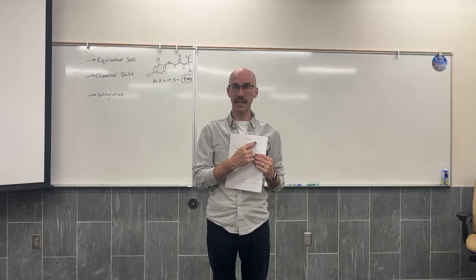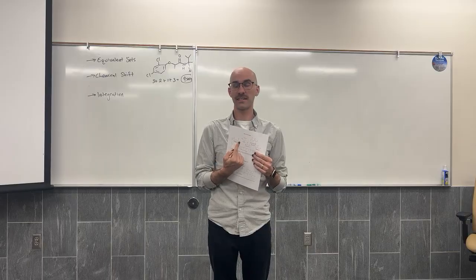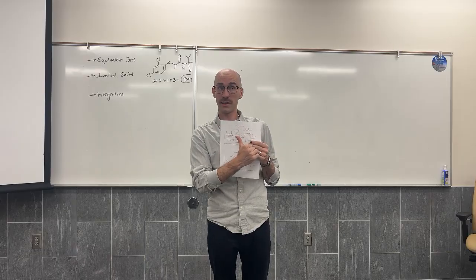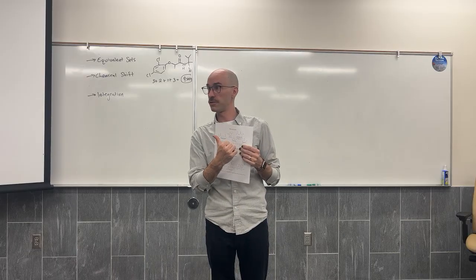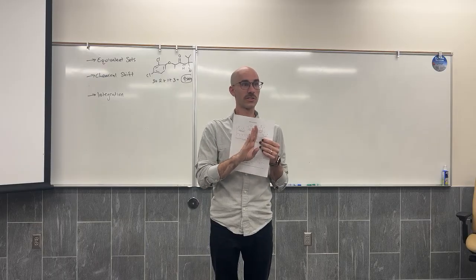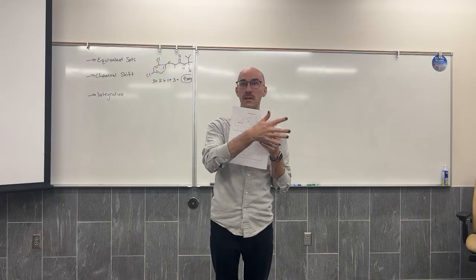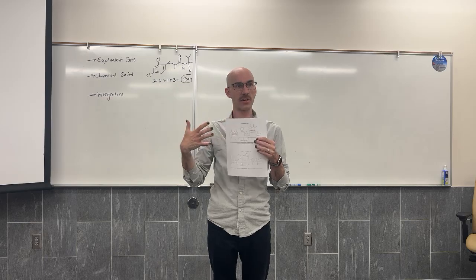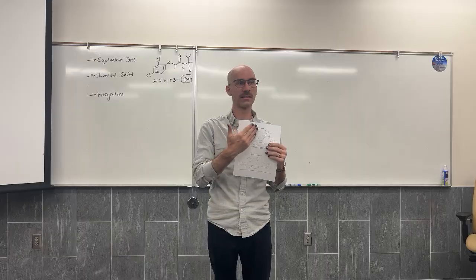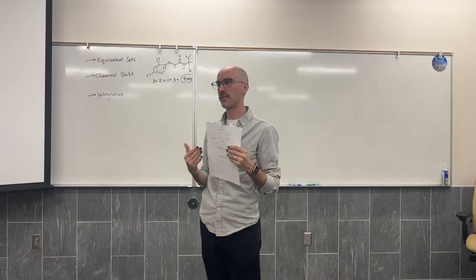Do you see how the hydrogen that's next to the carbonyl is on the right-hand side of that range? And the hydrogen that's next to the oxygen is on the left-hand side of that range? That's because the closer you are to the electronegative atom, the further left the signal goes. The further you are from an electronegative atom, the more to the right you are. So things adjacent to the carbonyl are further from the electronegative atom, so are further to the right. There's nuance in the way I've designed the way the molecule orients. Even with the aldehyde and the carboxylic acids, hydrogens from aldehydes are more on the right of that range. Hydrogens from carboxylic acids are more on the left of that range.